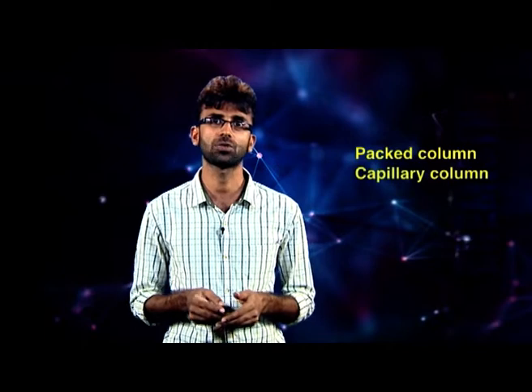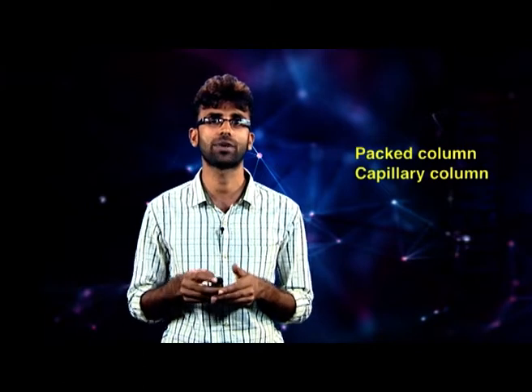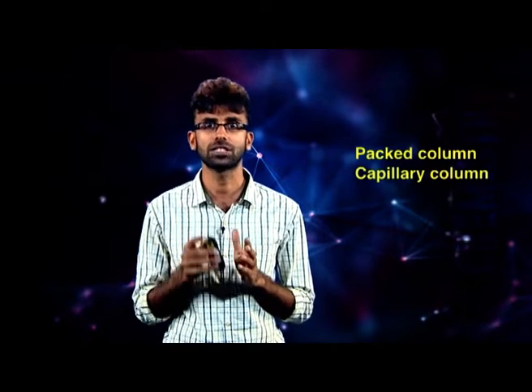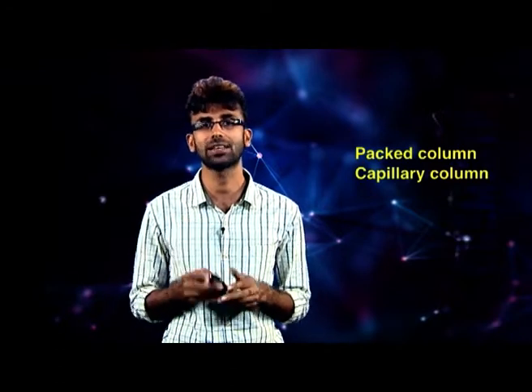In the first case, the packed column or supported column, the liquid stationary phase is supported on small particles of an inert porous solid material. Usually this type of column is 1 to 10 meters long and has a 2 to 6 millimeter inner diameter.